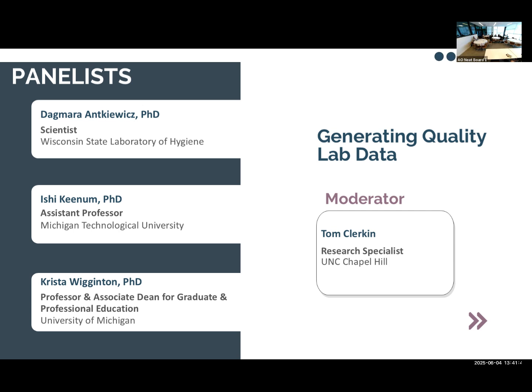Thanks for that. I'm Monica from the North Carolina State Lab of Public Health. And I think my question's for Krista, but maybe for anybody else. Have you found any other normalization strategies other than PMMOV that work well for different jurisdictions or different wastewater treatment plants or geographical locations? That's a controversial topic.